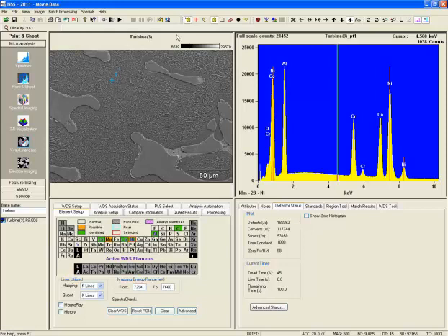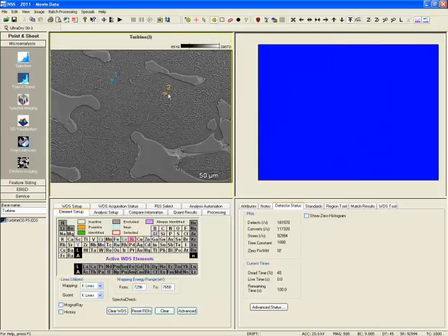We do not need to put down individual points on the location and permit a survey mode. We can also do a batch mode by disabling this one button up in the toolbar and laying down new acquisition locations. The acquisitions that we're doing are not necessarily points, but we can have area acquisitions.